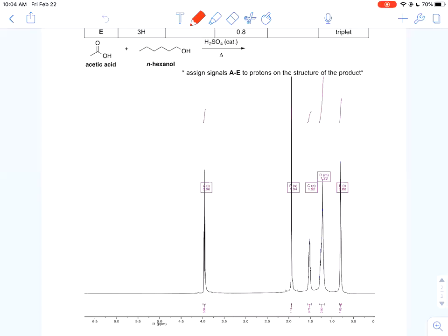Hello and welcome to the NMR video for apple oil. In experiment 5, if you're in room 275, you're going to be reacting acetic acid with n-hexanol, doing a Fischer esterification reaction and making n-hexyl acetate, also known as apple oil. It's an artificial apple fragrance.